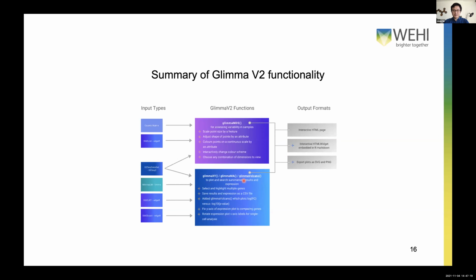And yes, Glimma Volcano is something that's also been requested for quite a while now that I never got around to implementing, but now that's available. So hopefully someone's happy about that.